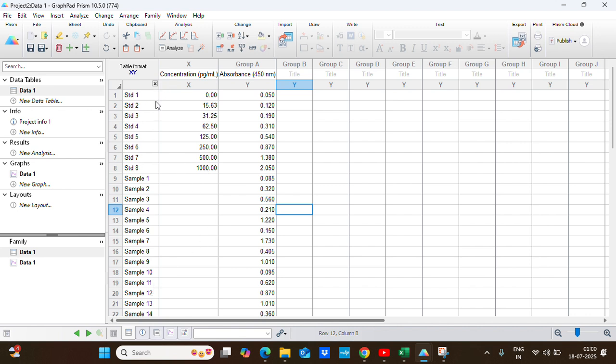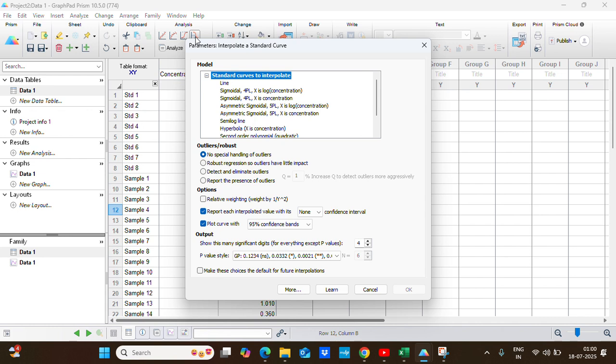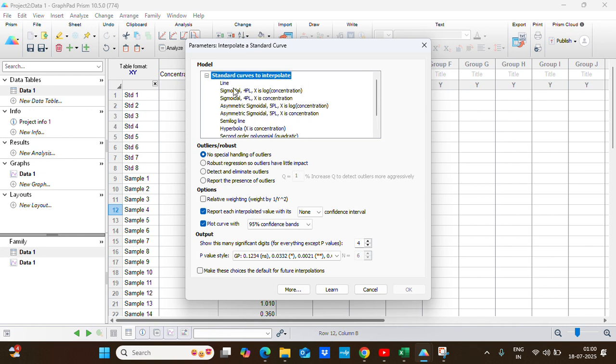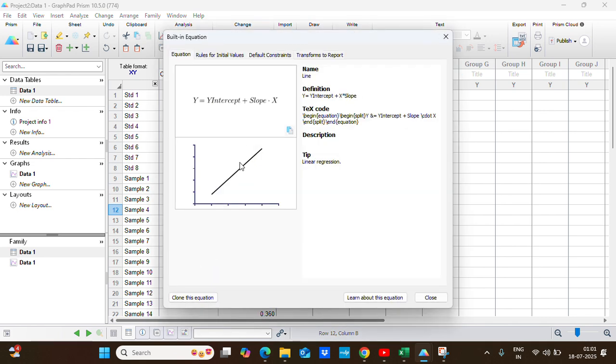Now we have to choose the interpolate a standard curve option here under the analysis tab. If you choose this one, it will open up a new window with several options. The first option is the standard curve to interpolate. You have to choose the appropriate model which represents your data. If you don't know, you can click that and you can see in detail the model equations and how its graph is represented.